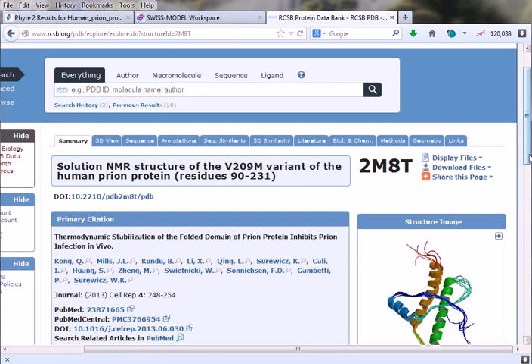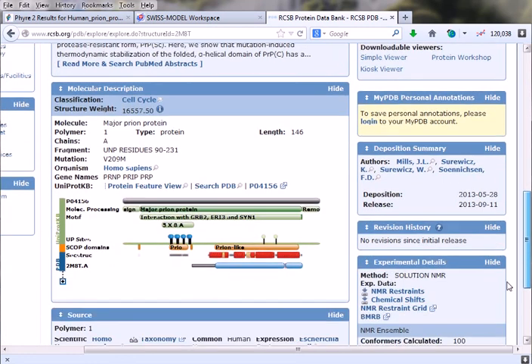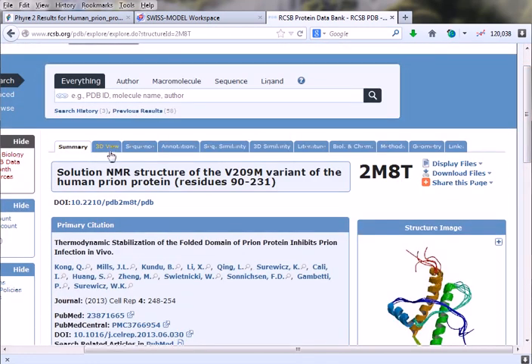Okay, so here it is, the first tab we are watching, the summary tab. Now if we look at 3D view, it will take us to the next tab providing the 3D view of our protein. You must have Java enabled in your browser, otherwise you cannot visualize this. In any kind of bioinformatics study, you must have a fully updated server as well as the Java system to visualize these molecular structures.